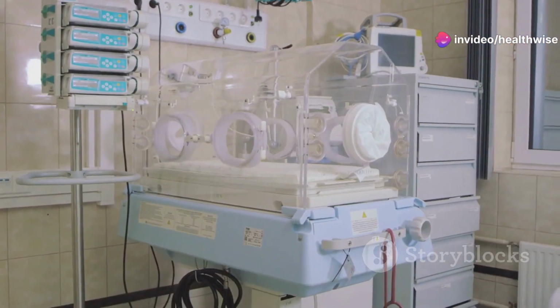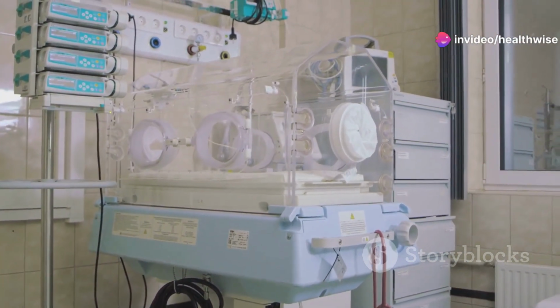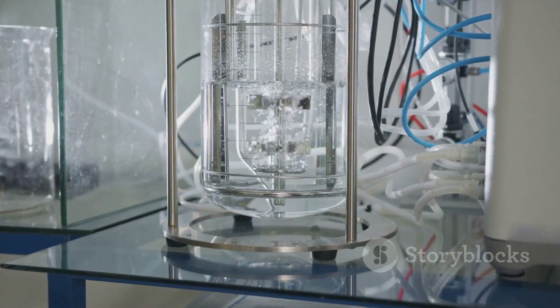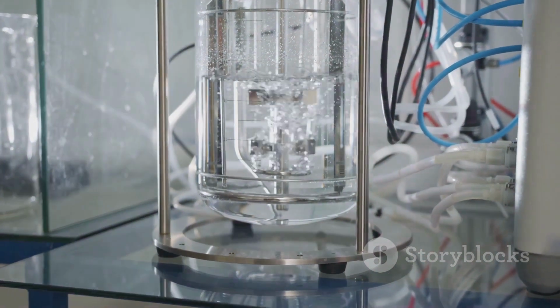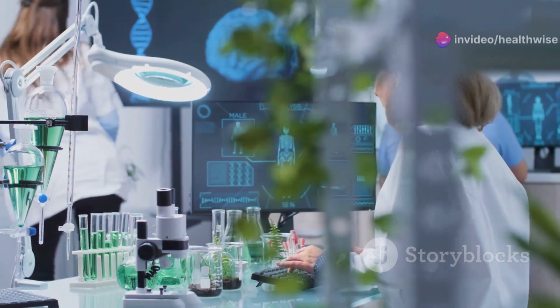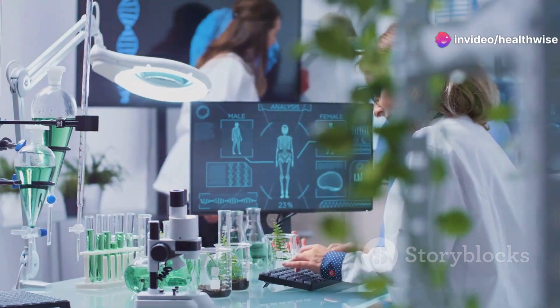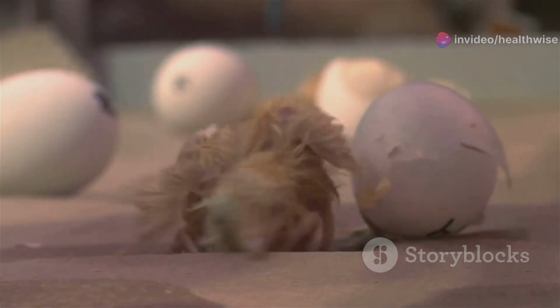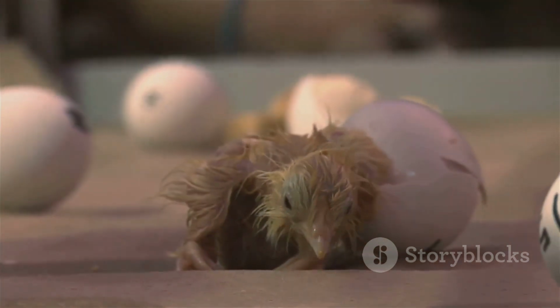Incubators are specialized devices used to create and maintain controlled environments. These devices ensure stability in temperature, humidity, and gas concentration. Scientists and researchers rely on incubators to grow and preserve cultures, cells, and tissues. The primary purpose of an incubator is to provide a constant and controlled internal environment.